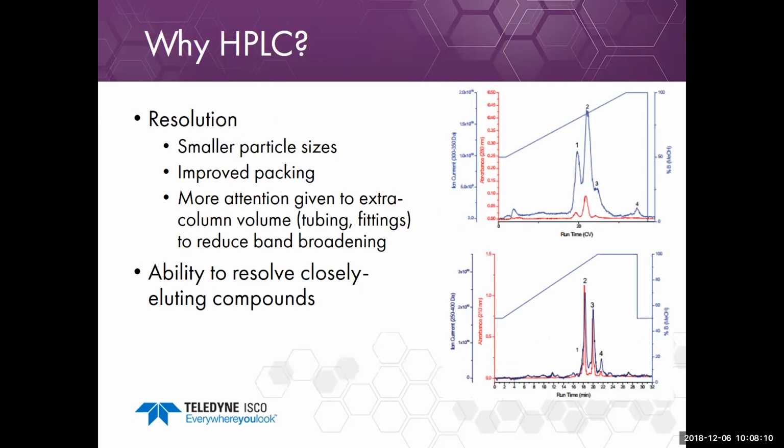So why do we use HPLC? I said earlier that flash chromatography worked very well. All of the concepts that apply to flash, I'm going to use for HPLC, so why would you use it? The equipment costs a bit more. Flash uses very cheap columns, whereas a prep LC system uses expensive steel columns.